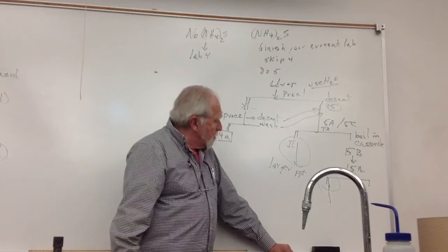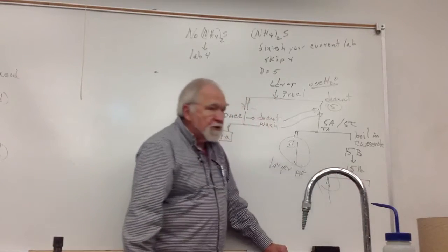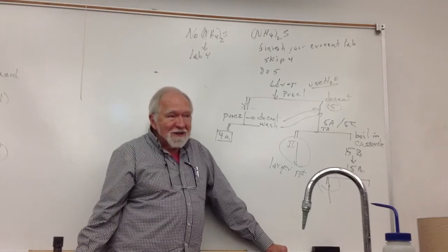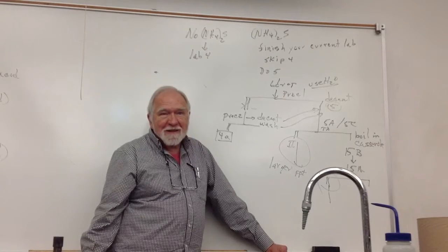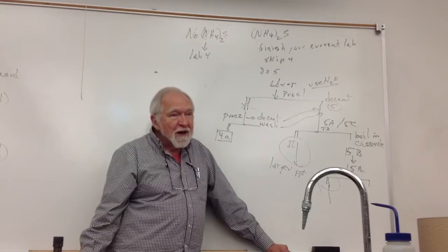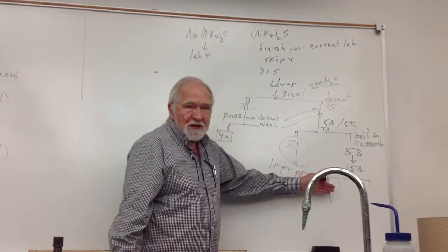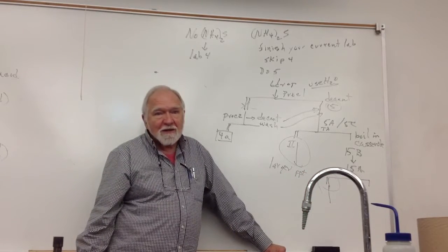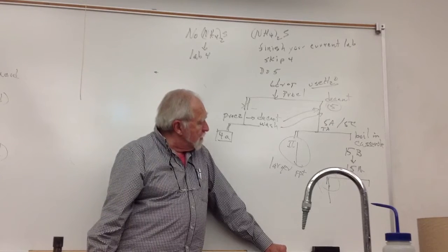Okay? So if you don't get much here, and you don't get much here, then you want to go right to procedure 23. Because most of my unknowns only have 1 or 2 groups in them. Some have something from all 4 groups. Some have traces in this group, medium amounts in this, which is more important, which is easier to find? Ones with the medium amounts. So that's the discussion of procedure 5.